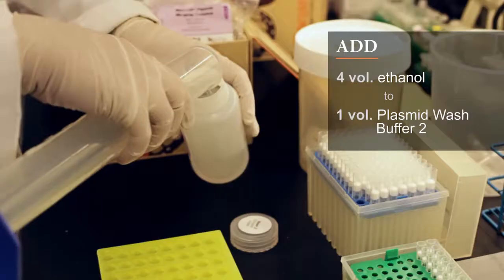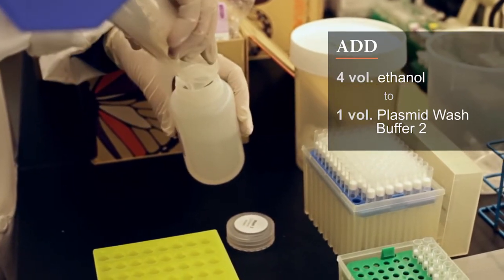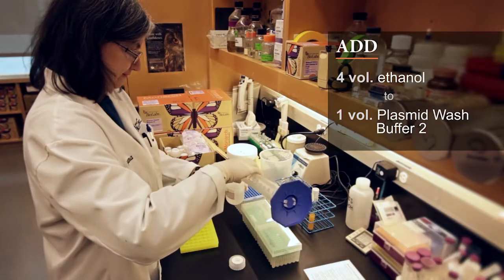You will need to add four volumes of ethanol to one volume of Plasmid Wash Buffer II according to the instructions on the bottle's label.